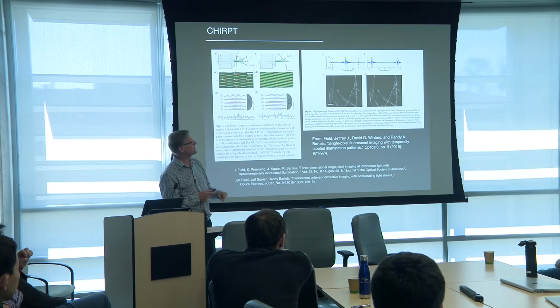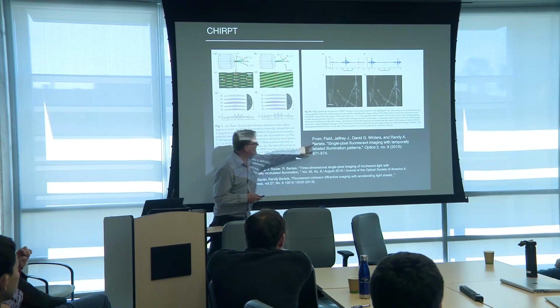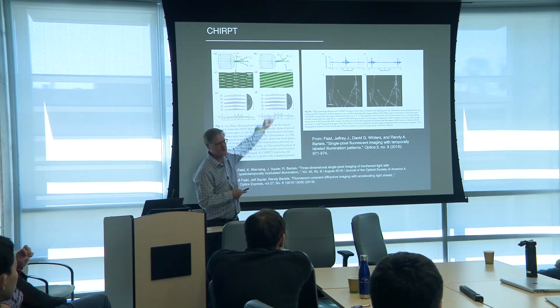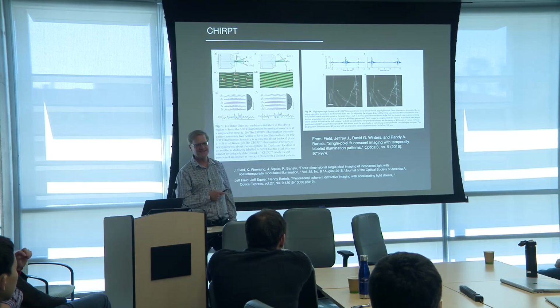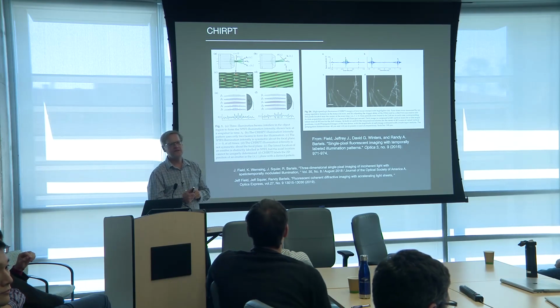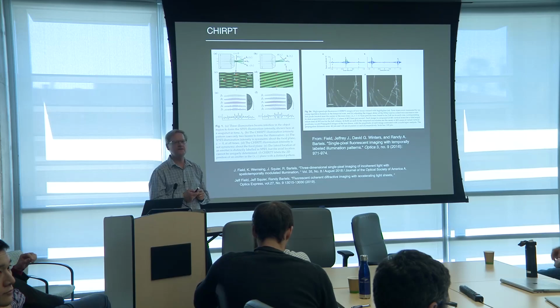So I think this is kind of on the horizon. And again, it was really Jeff Field's brainchild. For me, I'm not really sure how he realized one day that he had this imprint: command voltages for AODs. If you want to focus deep or focus shallow, you send these chirp waves.